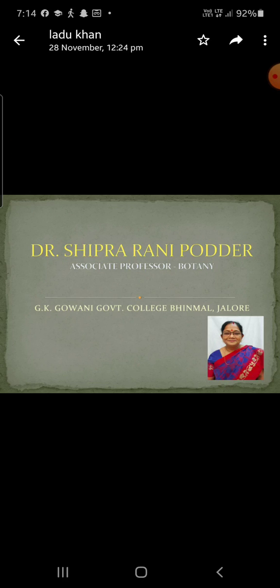A single vascular bundle is present in the midrib region. It is surrounded by a parenchymatous bundle sheath. The vascular bundle is conjoint, collateral, open and diploxylic.